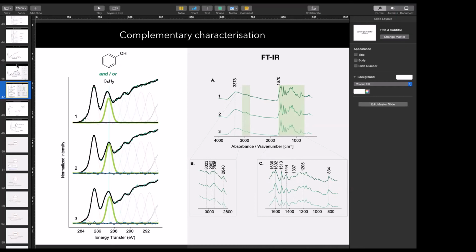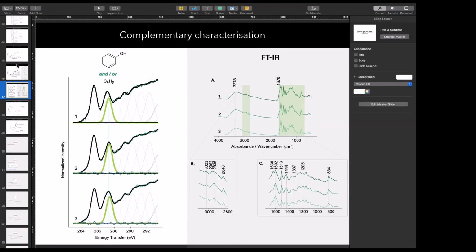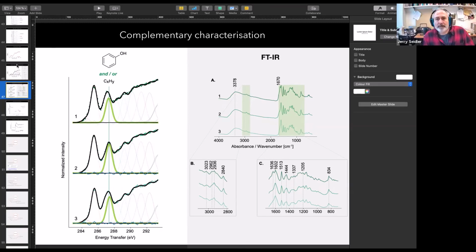Okay. And there's a second problem, which is the Compton background gets extremely large when you have a lot of heavier elements present. So both the absorption and the Compton background make it a much more difficult study. So doing XRS on heavier elements wouldn't be ideal either. It's been done if you want to study the heavy elements themselves. We have some papers on uranium XRS, for example, looking at very low energy excitations.